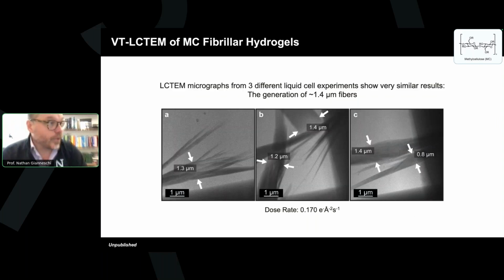So let's do it again. Go back in the lab and do this again was the consensus. This is the right-hand image, the same one that I showed you earlier, but he took that same procedure and repeated it multiple times, and we see this same kind of effect. This shows the fiber diameter, if you like, made up of these individual 20 nanometer fibrils, and you can see that here in this case as well. These are fibers of, let's say, 1 to 2 micron diameter.